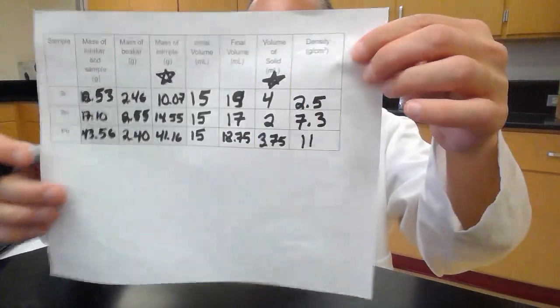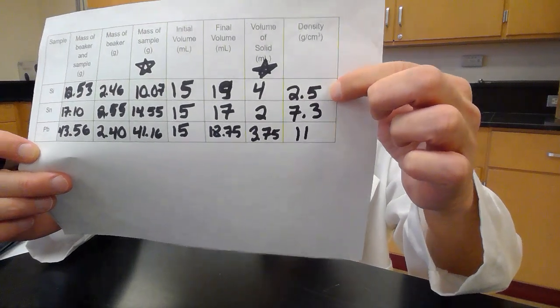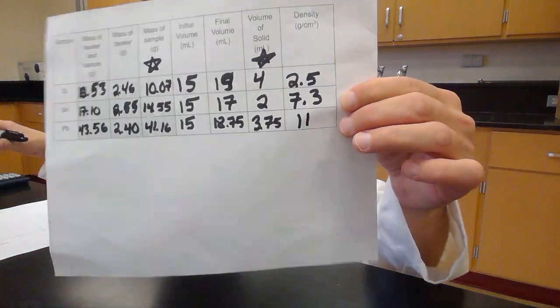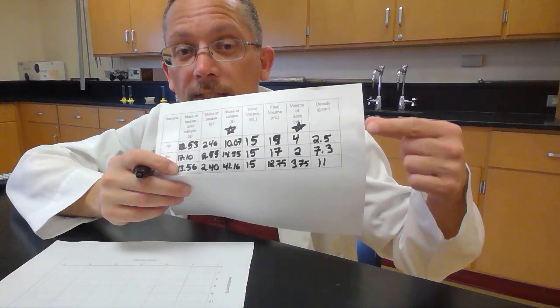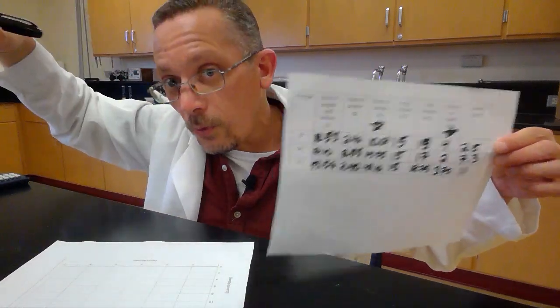Okay. So now I have the densities of my three materials here. 2.5 grams per cubic centimeter, 7.3 grams per cubic centimeter, and 11 grams per cubic centimeter. Now, number 3 in the Postlab questions is going to ask me to make the same kind of graph that we made before we did the lab. So I'm going to do the same thing. And I'm going to predict the density of the missing one, the one that's in row 4.